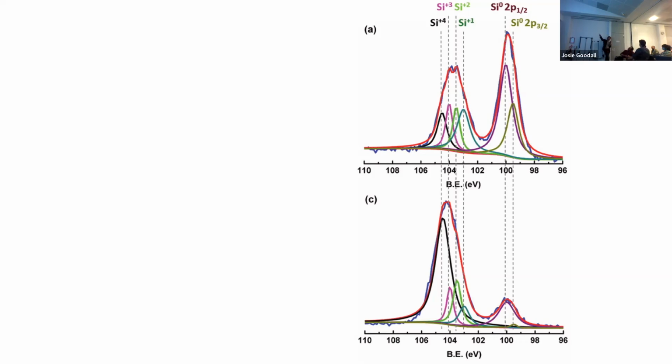Well, I think it's almost symmetric. I think the spin orbit coupling is still there. Yeah, it should be there, right? Yeah, it definitely is. It can't be completely symmetric. It may be symmetric within the error of the measurement. I would say fit it with a spin orbit coupling.